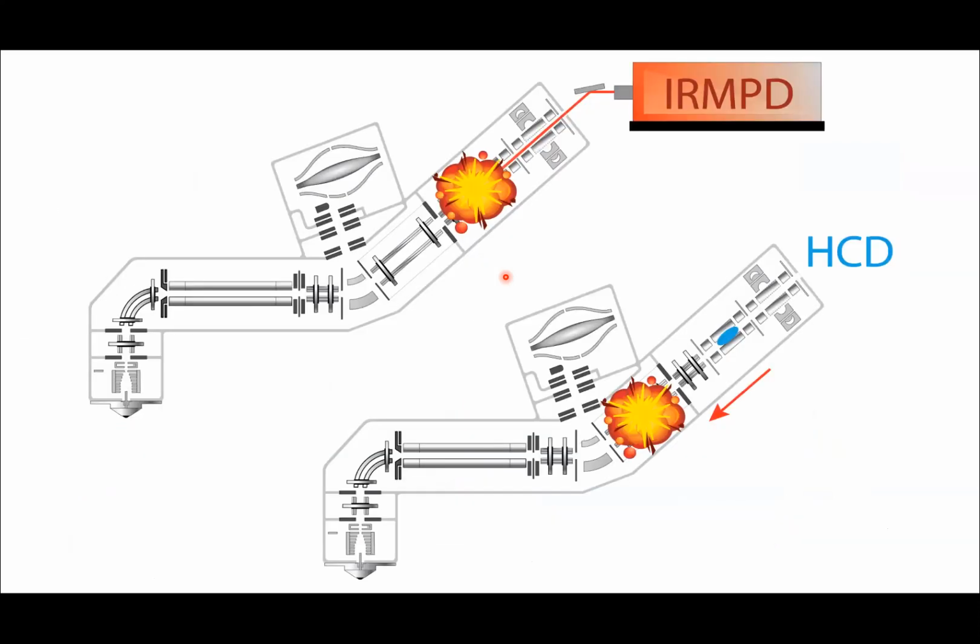So we had this idea, and this is a little bit exaggerated. We don't really have fire coming out of our mass spectrometer, but in HCD, we are making the thing fall apart by collisions in this region. We have a different way to make peptides fall apart, and that's using photons. I introduced this earlier. We can just shoot a laser beam down the axis of our device, and we can basically think of sort of melting these things. We can slowly cook them with this IR energy and pop off the TMT tag.